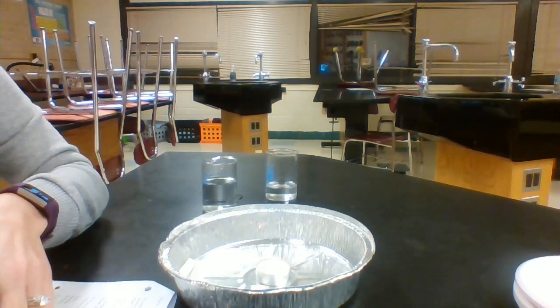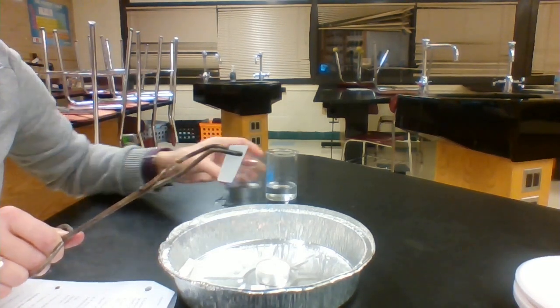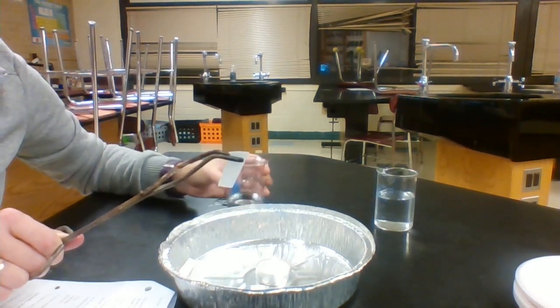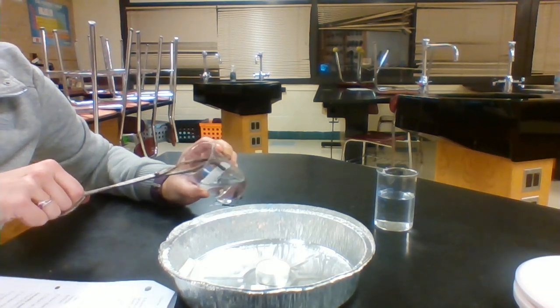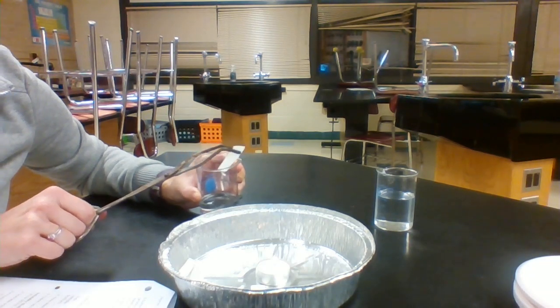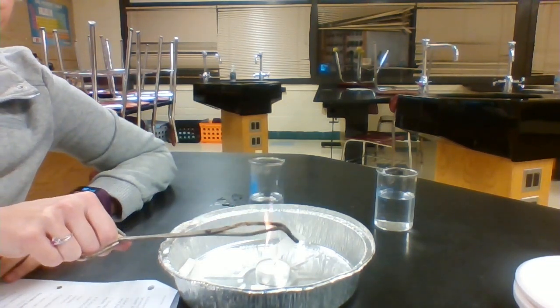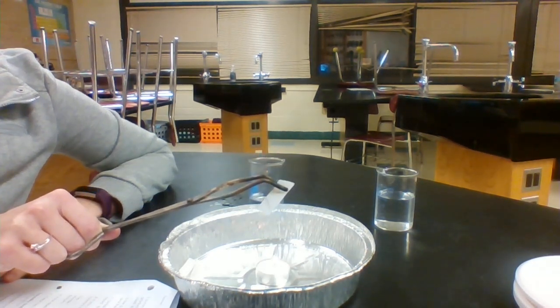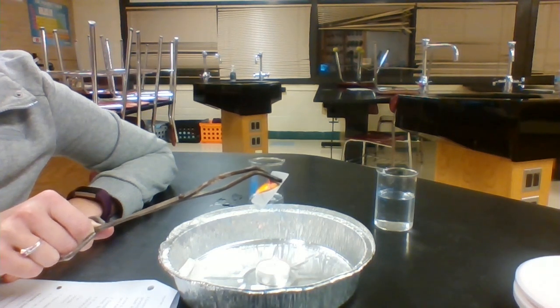What I'm going to do now is take my second piece of paper. I put it in the tongs. I'm now going to dip this into the rubbing alcohol, and we're going to see if this one is flammable. So I dipped it in. I'm going to let it drip over the container just to get off any excess. I'm then going to place this over the flame. And as you can see, this one did catch on fire, and it continues to burn.